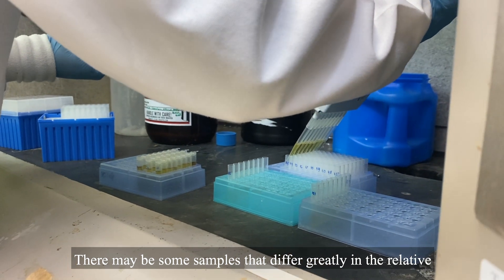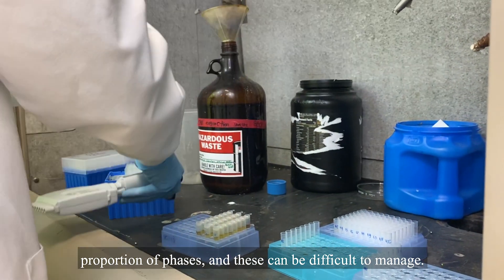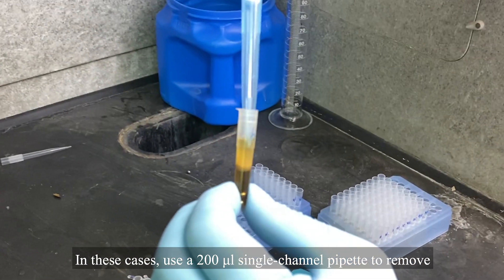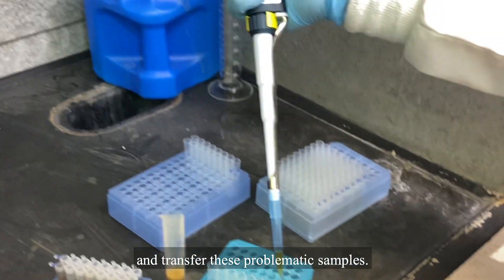There may be some samples that differ greatly in the relative proportion of phases, and these can be difficult to manage. In these cases, use a 200 microliter single channel pipette to remove and transfer these problematic samples.